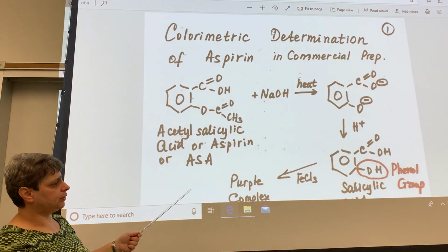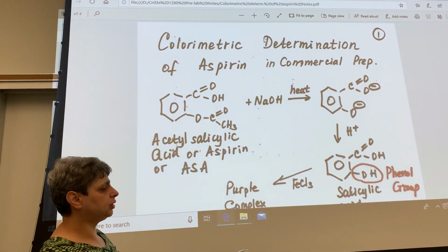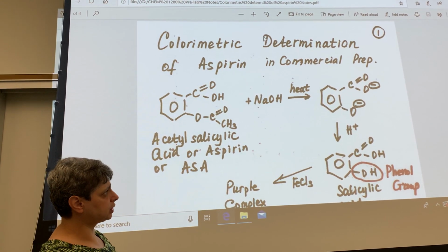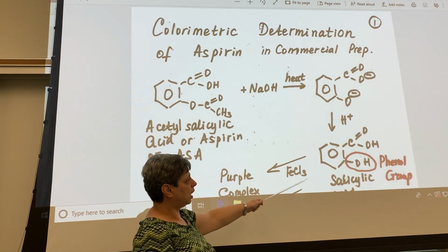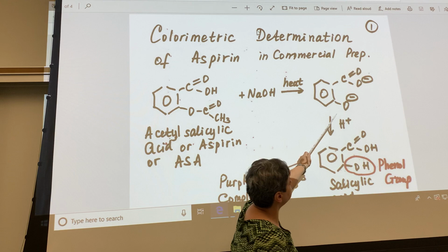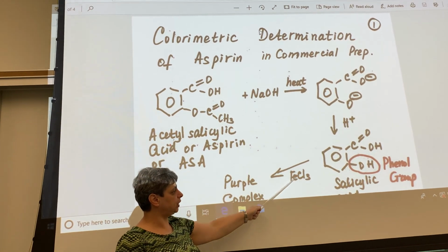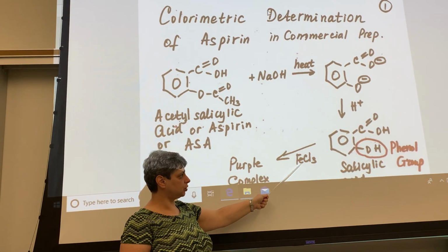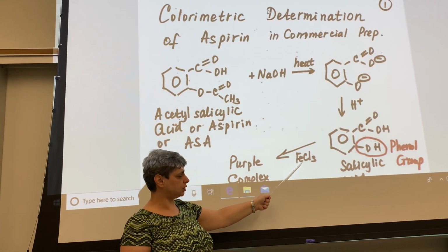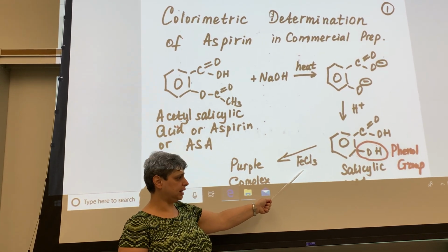So I started talking about that yellow solution that will be in jugs that you'll be adding to a certain amount of your stock solution. So what are the ingredients in that yellow solution? Well, HCl is a source of H+. Second, of course, is FeCl3. If you recall, FeCl3 is yellow in solution, so no surprise there. The solution in those big brown containers in the hood will be yellow.